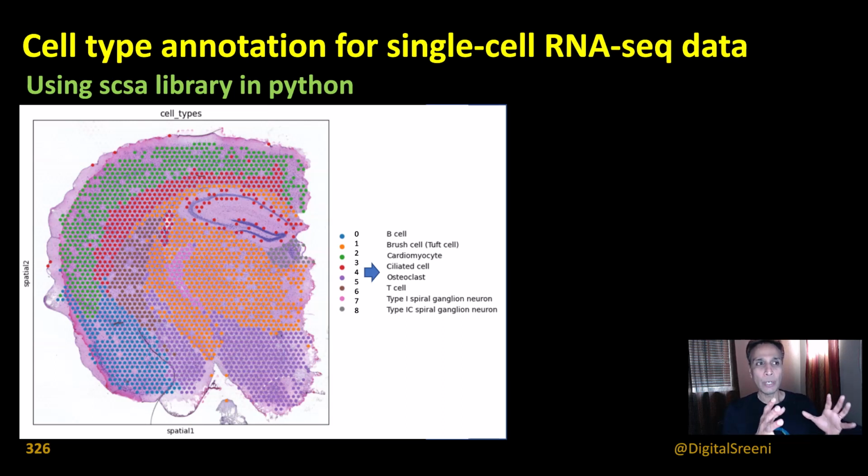And again, we're not going to identify the tissue types. I'll briefly explain the difference between cell type and tissue type for those of you who are newbies to this bio field, because these may sound similar, but they are slightly different terminology.